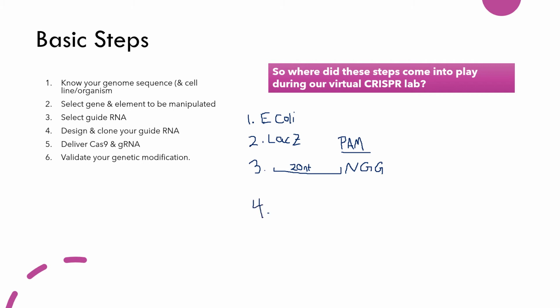so that we can have this DNA, PAM site DNA, be expressed as a guide RNA in the bacteria. So in the case of E. coli, the best way to do that is actually to make the guide RNA as a plasmid. And there's a promoter on it.